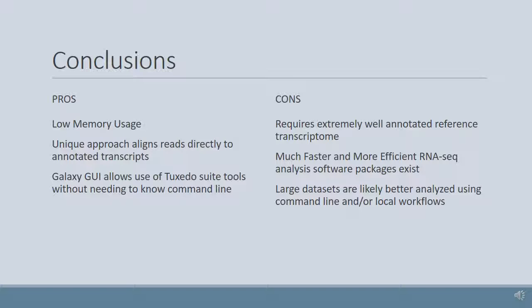Another thing with Galaxy, the larger the data set you have, the longer it's going to take, and especially using that public instance, you're probably better off installing your own local instance or learning how to run command line tools.